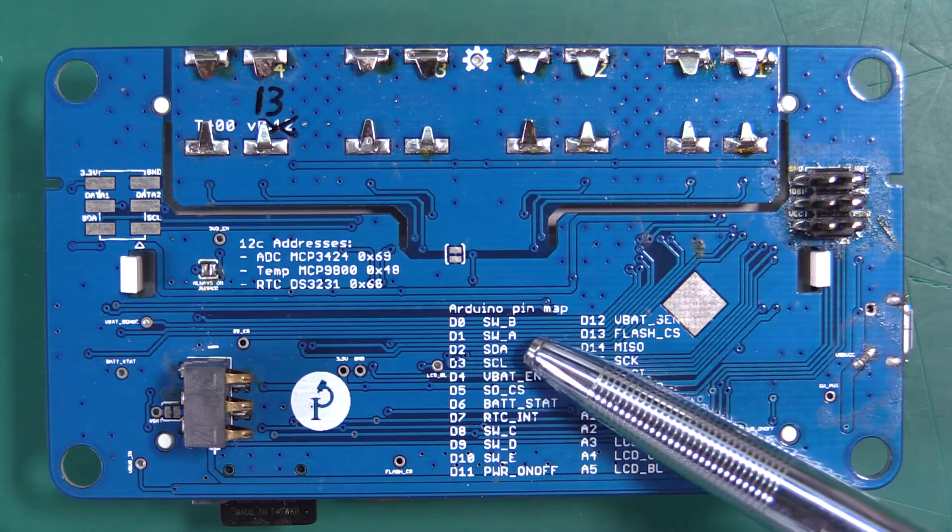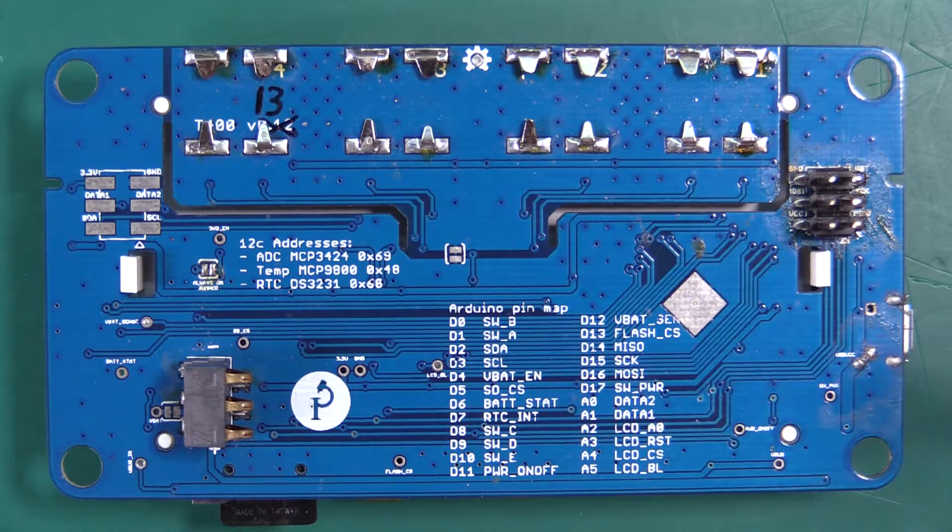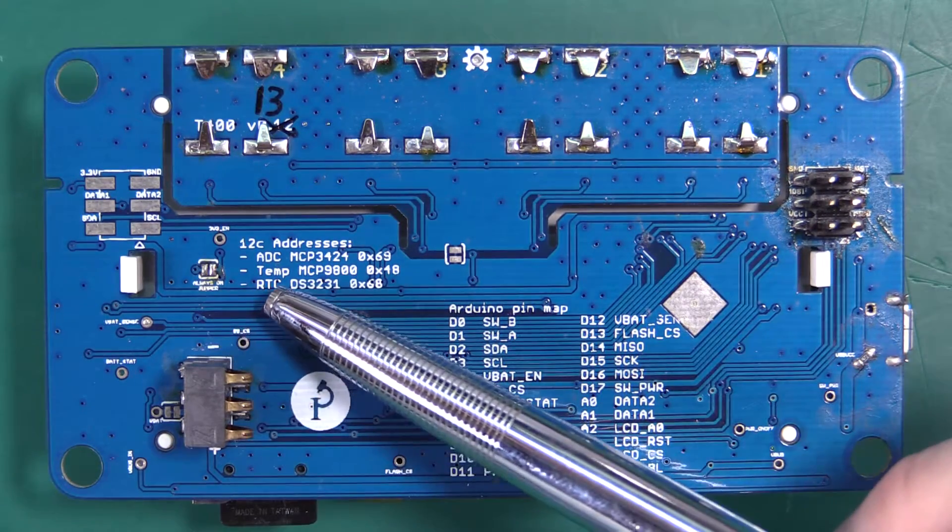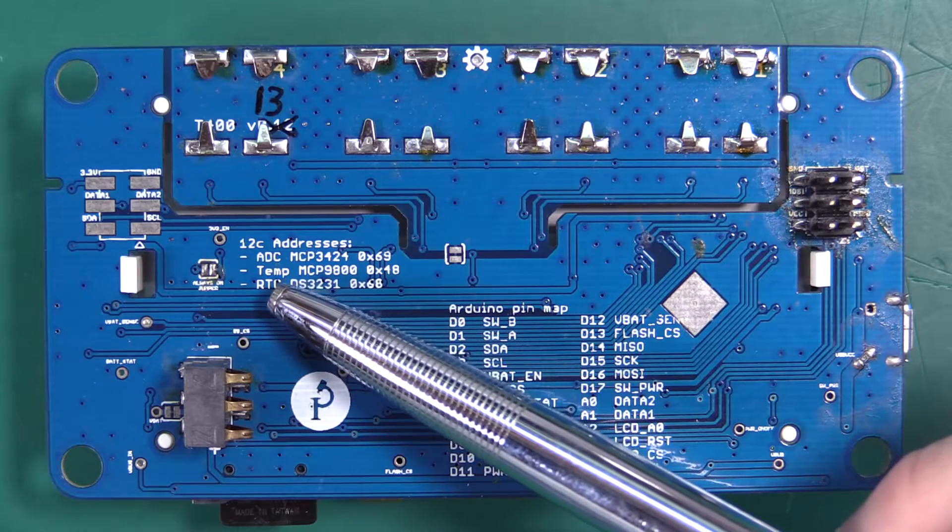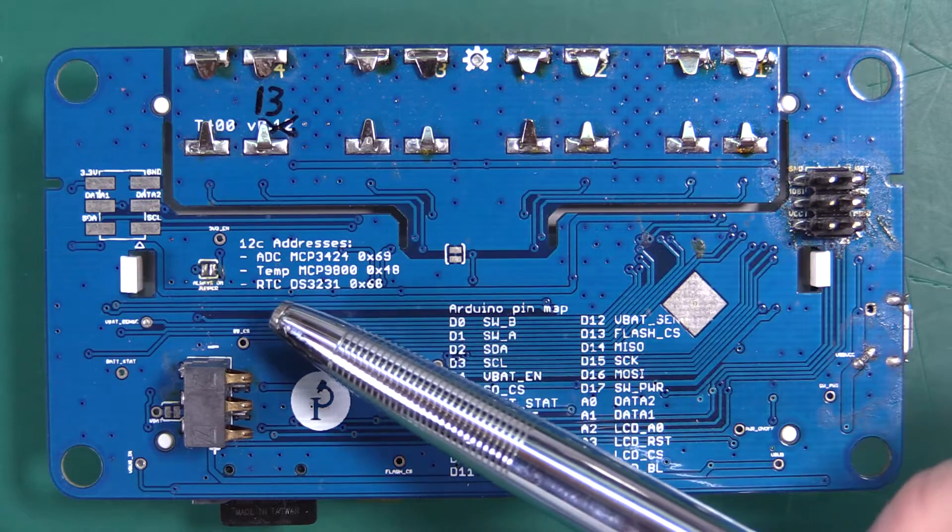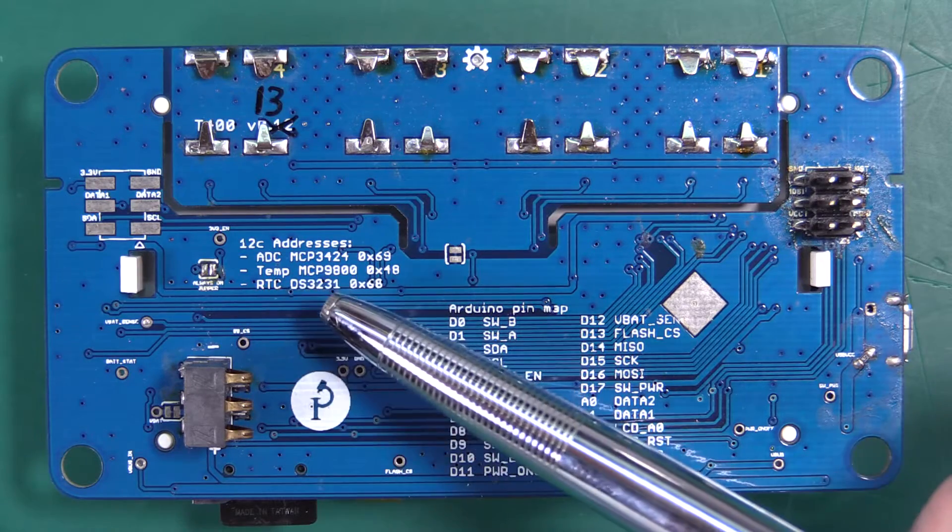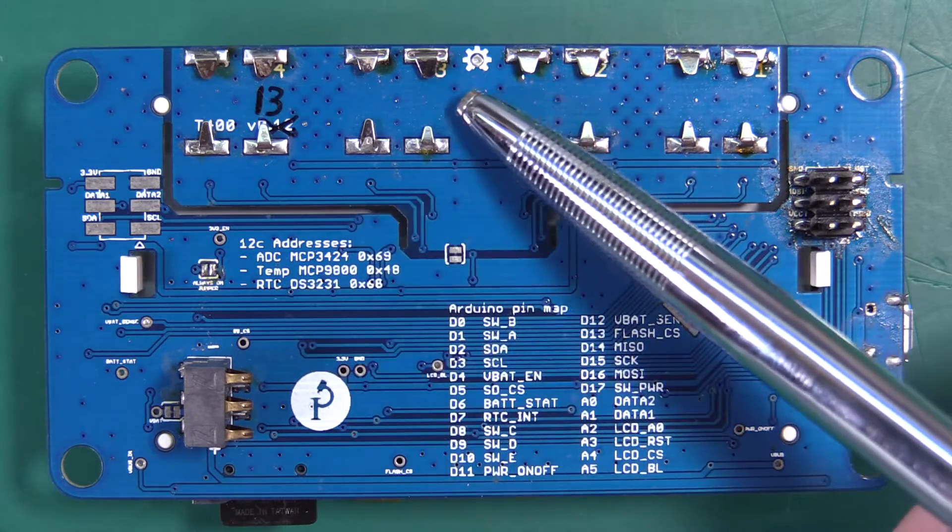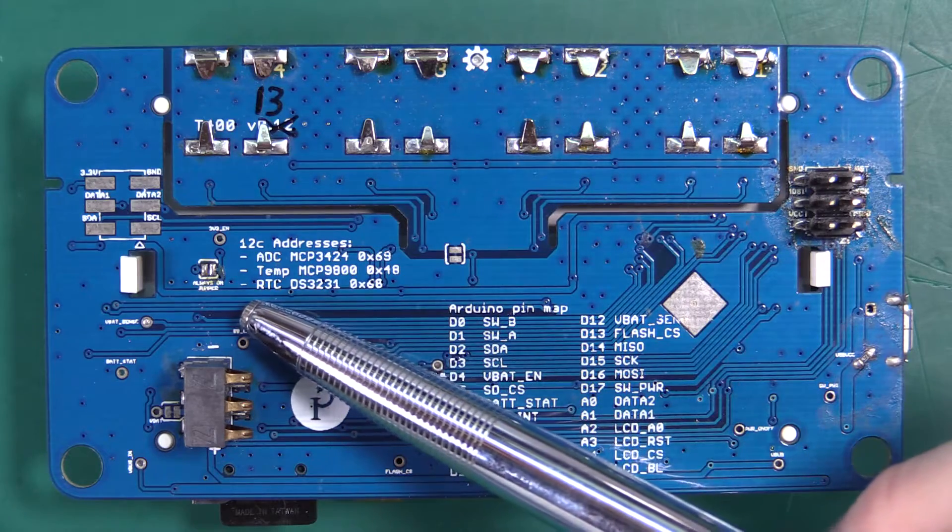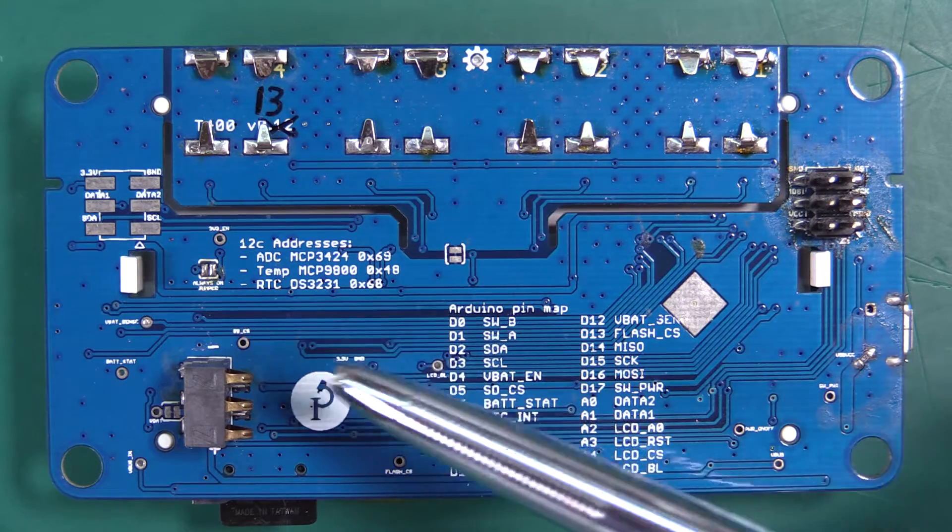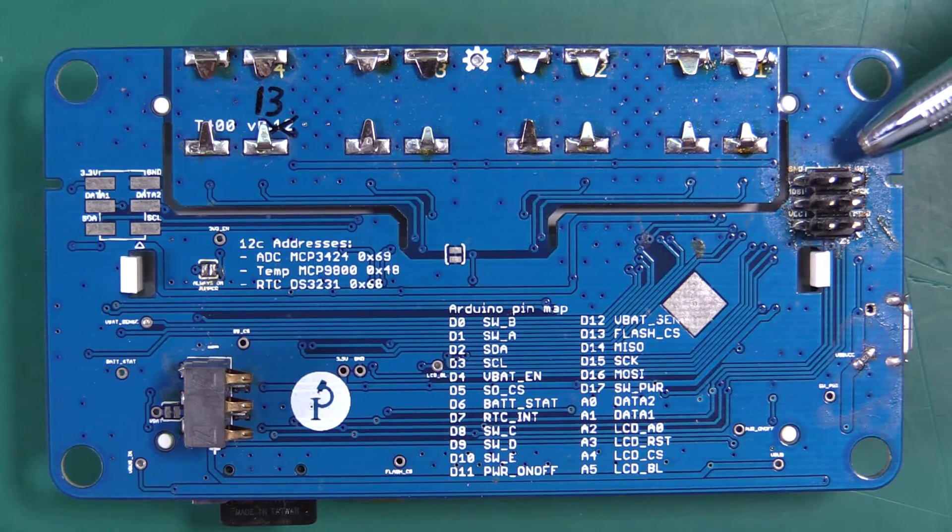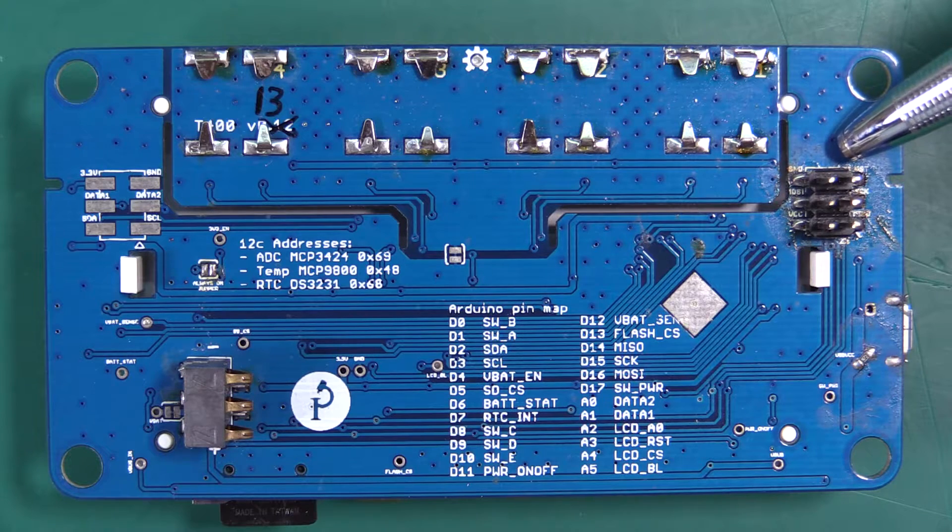We also have the I2C addresses for reference for the analog digital converter, the onboard junction temperature sensor and the real-time clock. We have standard ICSP header.